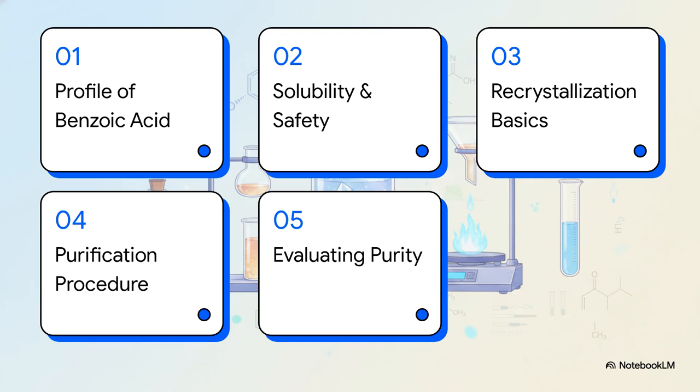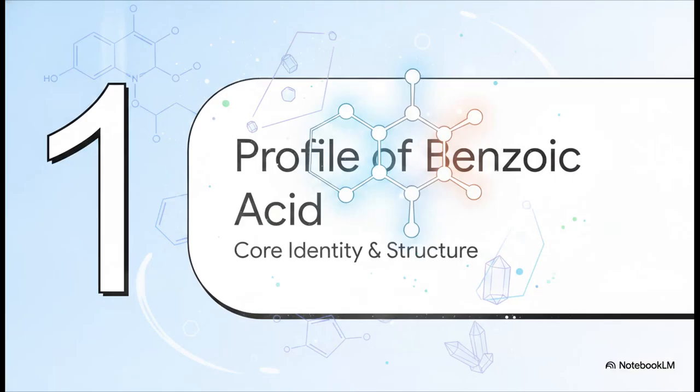Here's the agenda for today's explainer. 1. The profile of benzoic acid. 2. Solubility and safety basics. 3. The principle of recrystallization. 4. The purification procedure. And 5. Evaluating crystal purity.